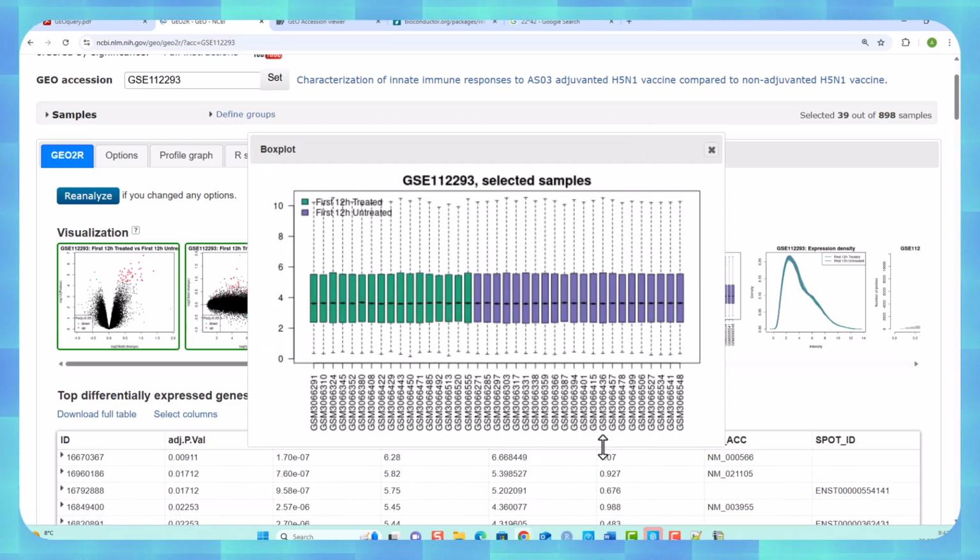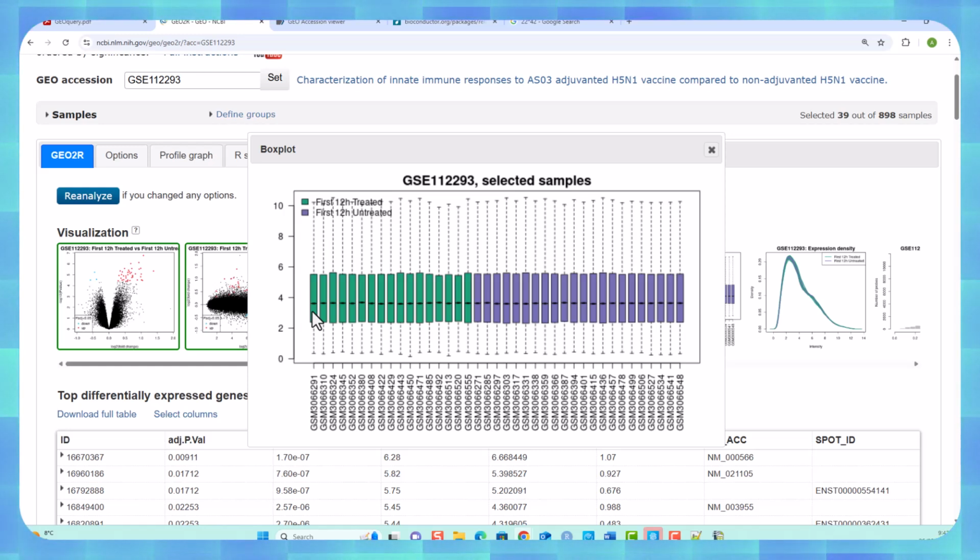This plot is a plot to check that the samples are all equal to each other. Now, when you're doing repeats of an experiment, you might put more or less sample onto the thing. So the first job you have to do when you're comparing all your samples is to make sure that they all have the same basic level. They're all standardized to having the same concentration across all the experiments.